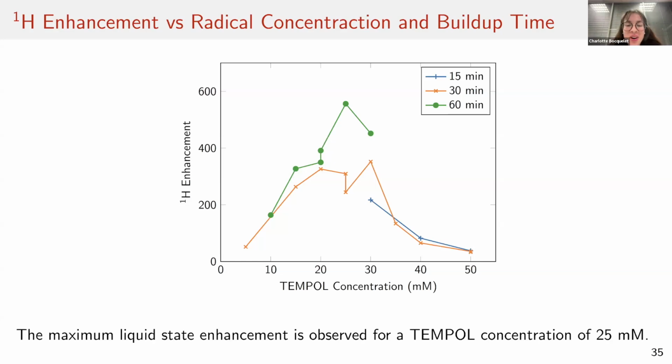No. Okay, the final question is from Azif. It's interesting. Could you compare the efficiency and the cost of pyruvate hyperpolarization using parahydrogen and that using bullet dissolution DNP? Which technique will be the winner, according to you?